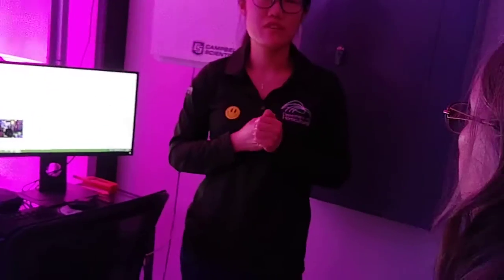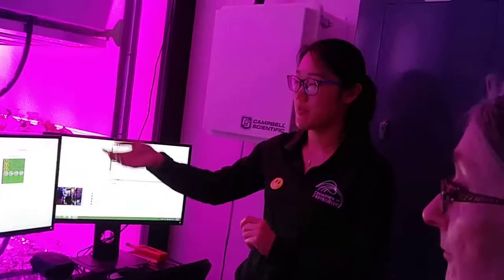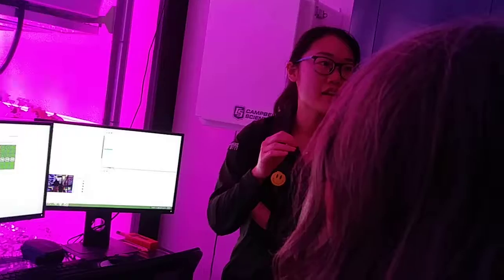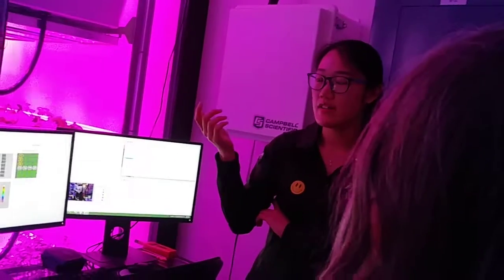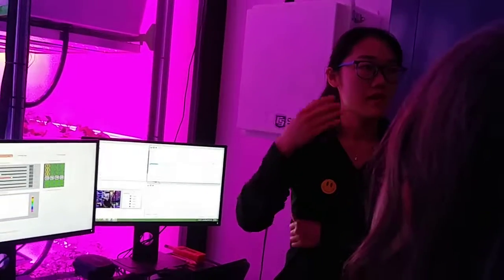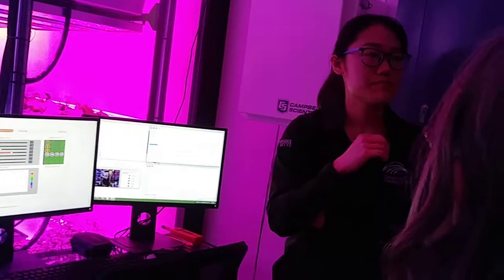And that's not a very good thing for the plants. And for the hydroponics, currently we didn't experience any disease in here, but sometimes, for example, if you change the light intensity too high, the light is too bright, there might be some tip burns on the lettuce.